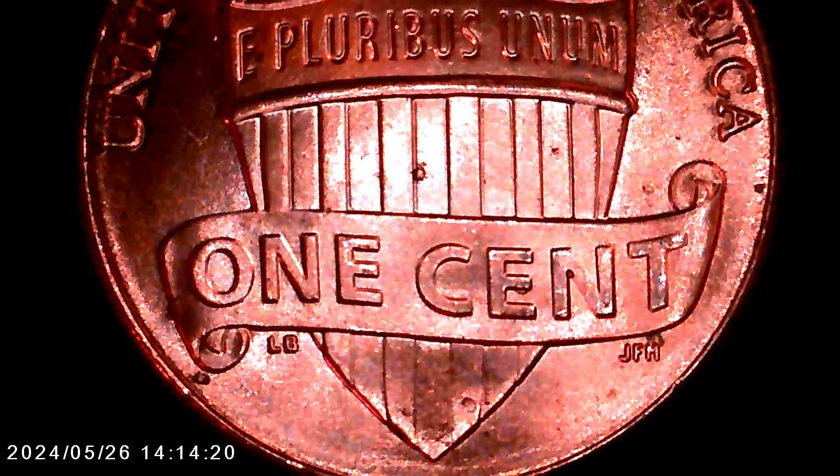And now in this shot right here I've moved the scope down as close as possible to it to achieve the maximum magnification level. And we'll get that focus locked right in. And there you go. Right there. We'll just pan side to side quickly. And you can certainly see everything in very very great detail.